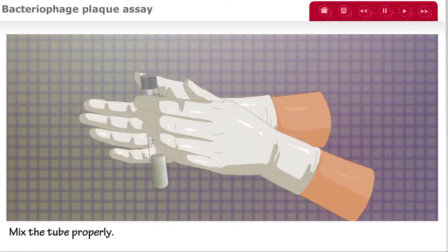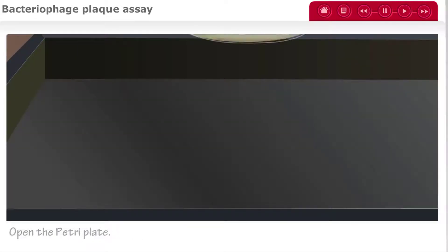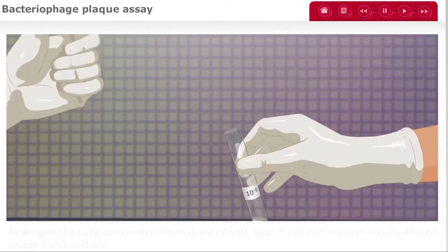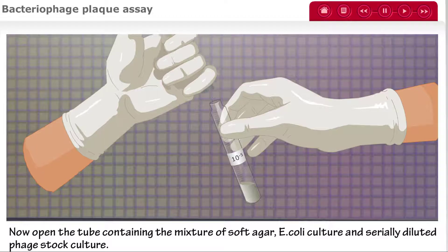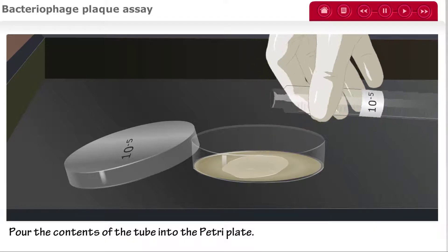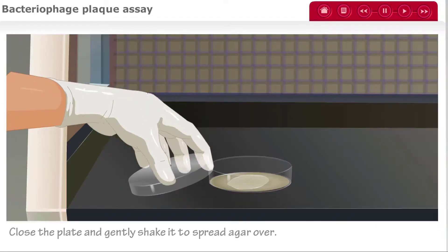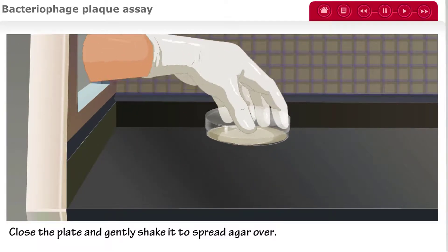Mix the tube properly. Take the petri plate marked 10 to the negative 5 and open it. Open the tube containing the mixture of soft agar, E. coli culture, and serially diluted phage stock. Pour the contents of the tube into the petri plate, then recap the tube. Close the plate and gently shake it to spread the agar evenly over the bottom.